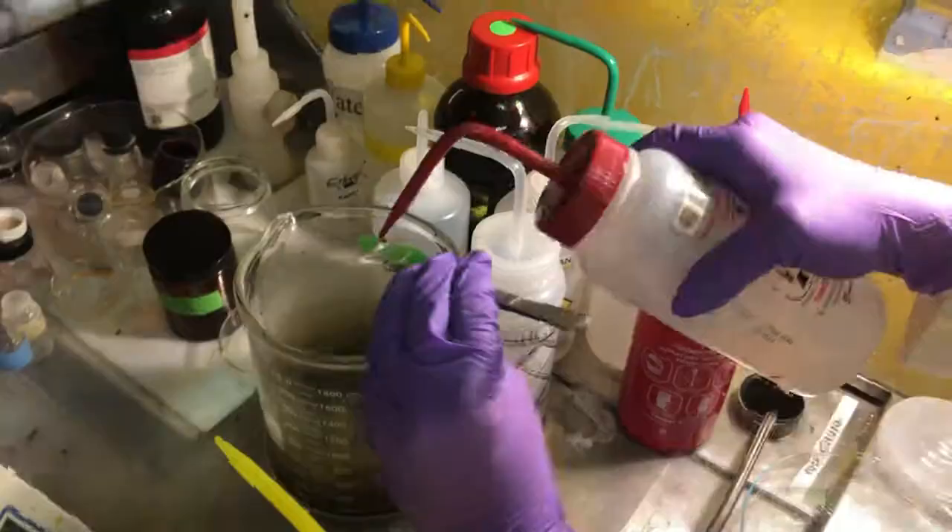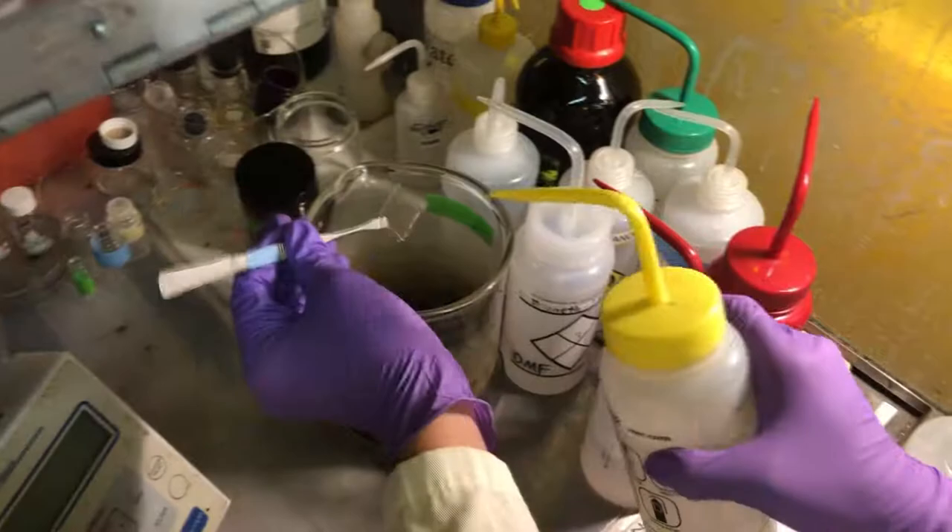After our first round of cleaning, it was time to rinse each substrate with our cleaning solutions and dry them off with a nitrogen gun.